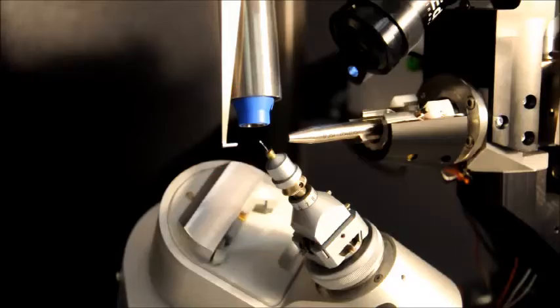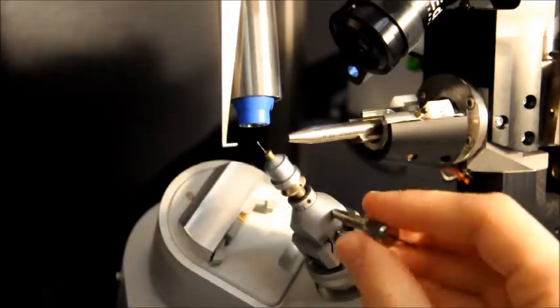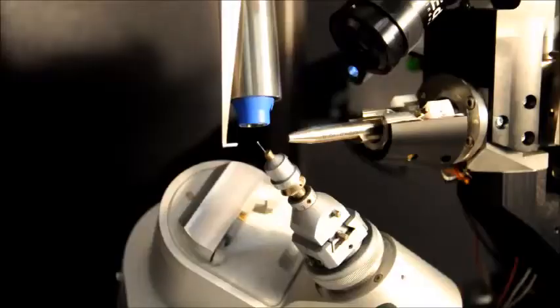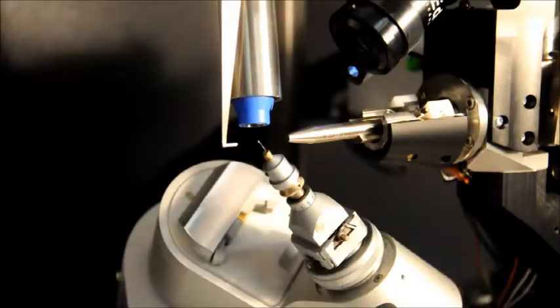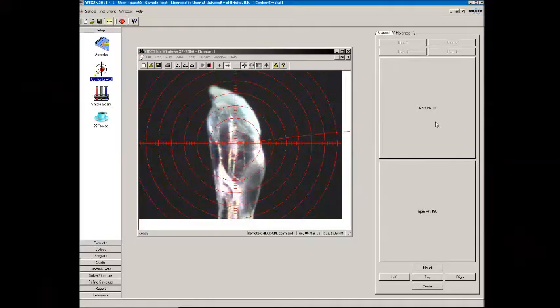Unfortunately, I couldn't work out how to run the split screen in my editing software. So you'll just have to watch the crystal's movements and my adjustments one after another. There, now it's centered.